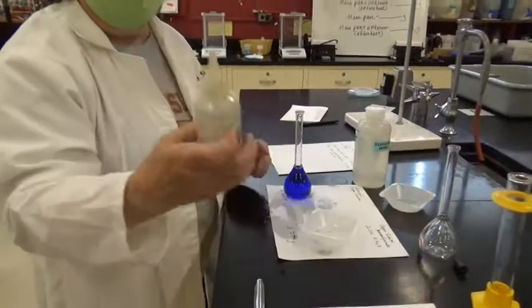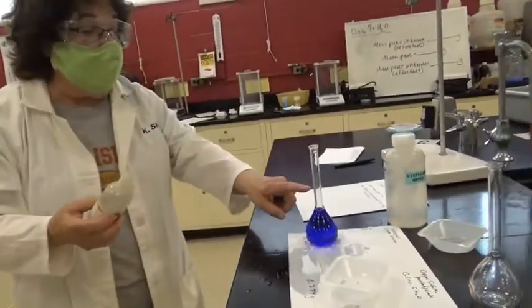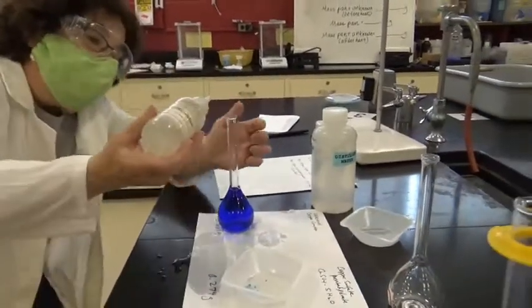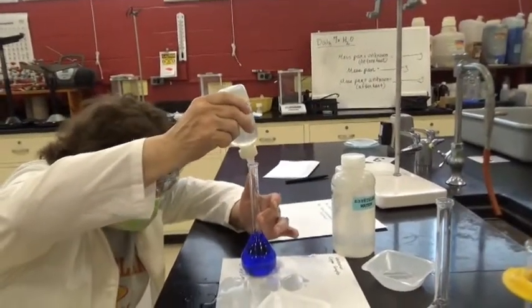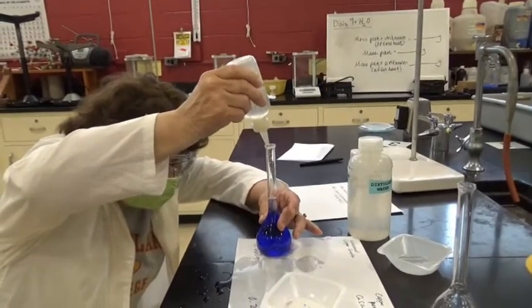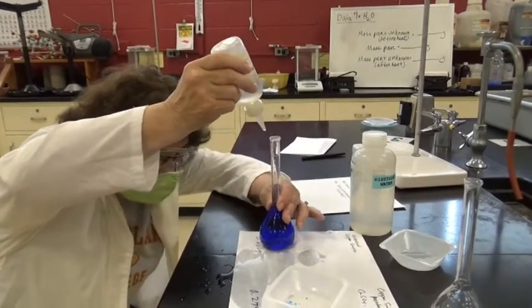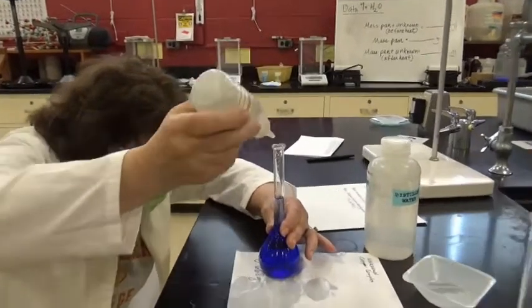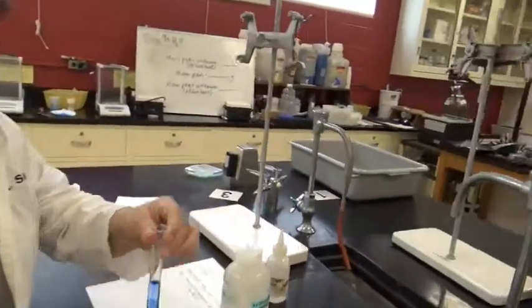And let me see, I have a dropper bottle also with distilled water, and I'm going to use that to finish it off. Now, my eye has to be right at the level of that mark, so I'm going to try to be careful here. Some bubbles. Oh, perfect. Hold it up, let's see if we can get a close-up.